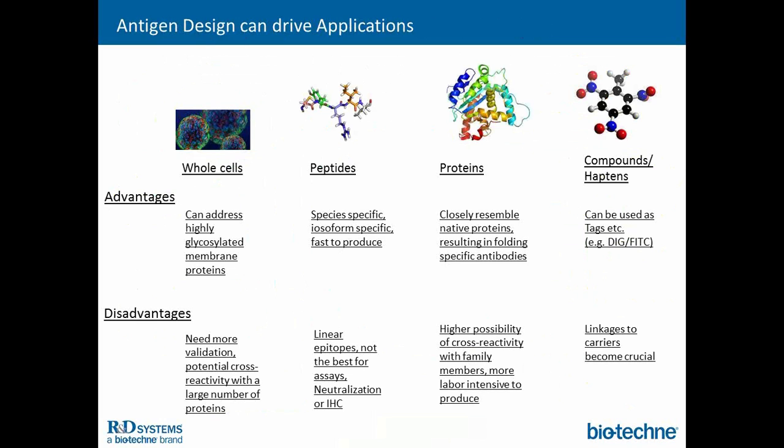Now, the problem starting with a full-length protein, obviously, is that you have a higher possibility of cross-reactivity with other family members, so you need to be very careful when you develop these and put all the right testing and controls in place to make sure you're really only recognizing the protein of interest.